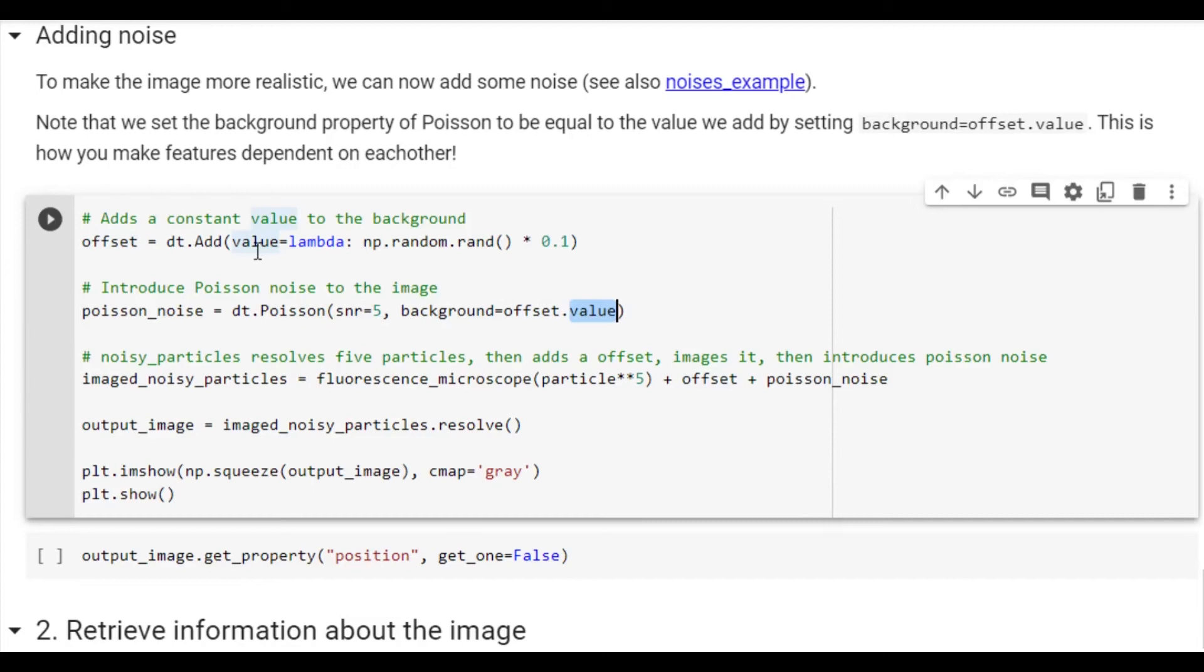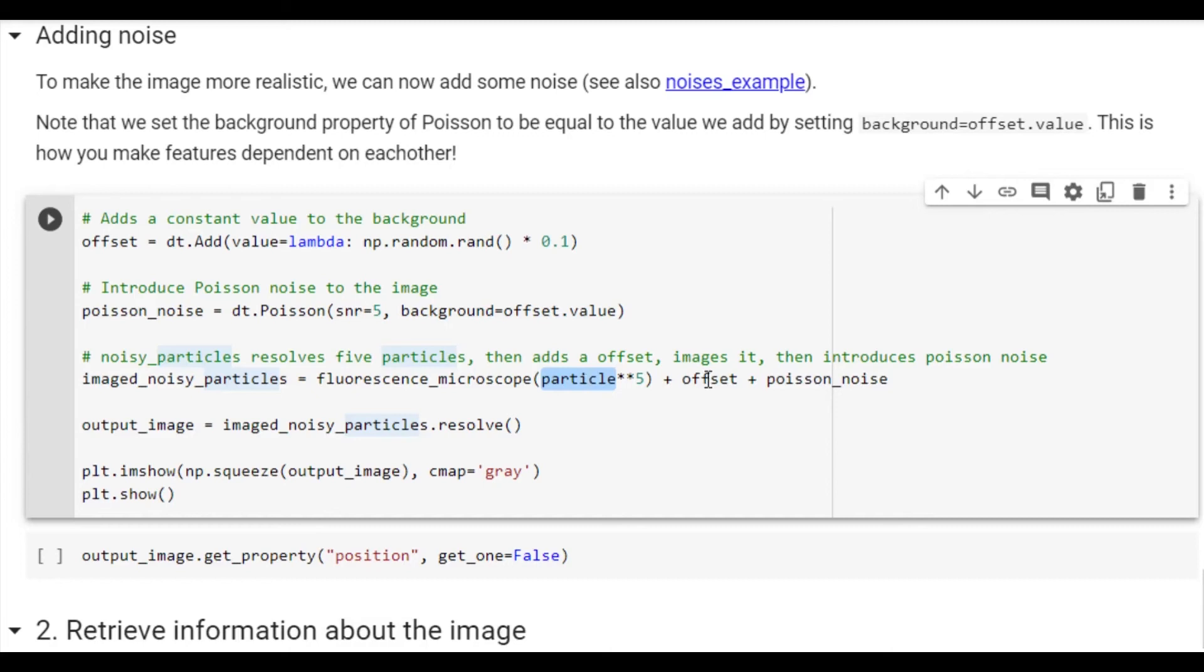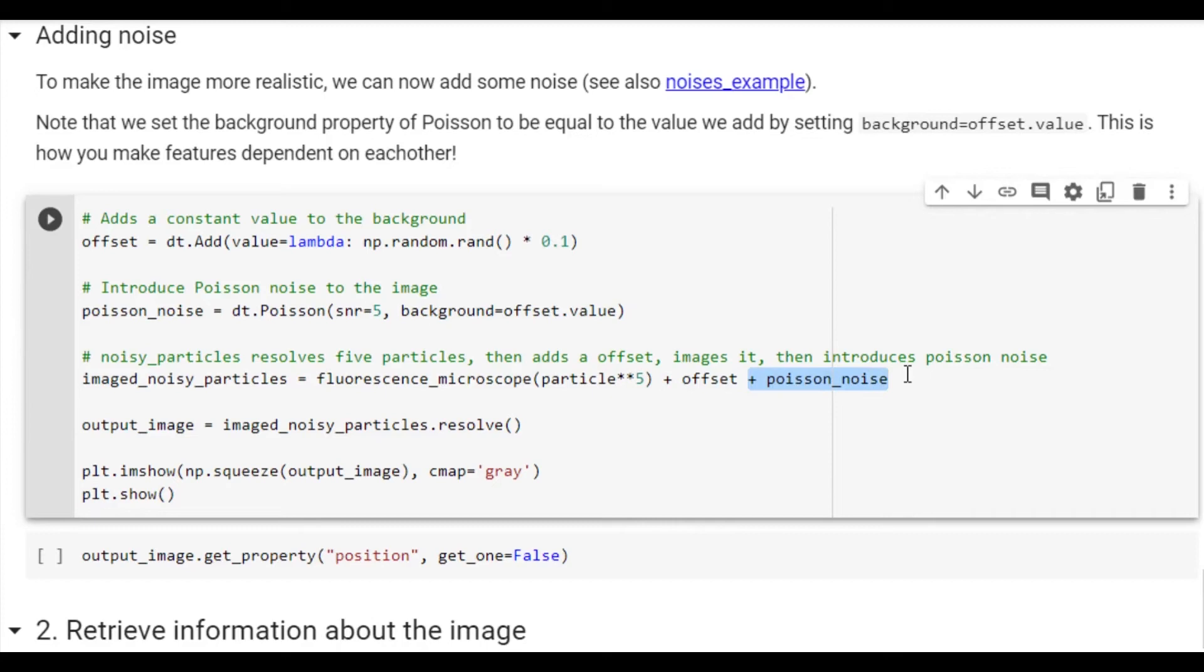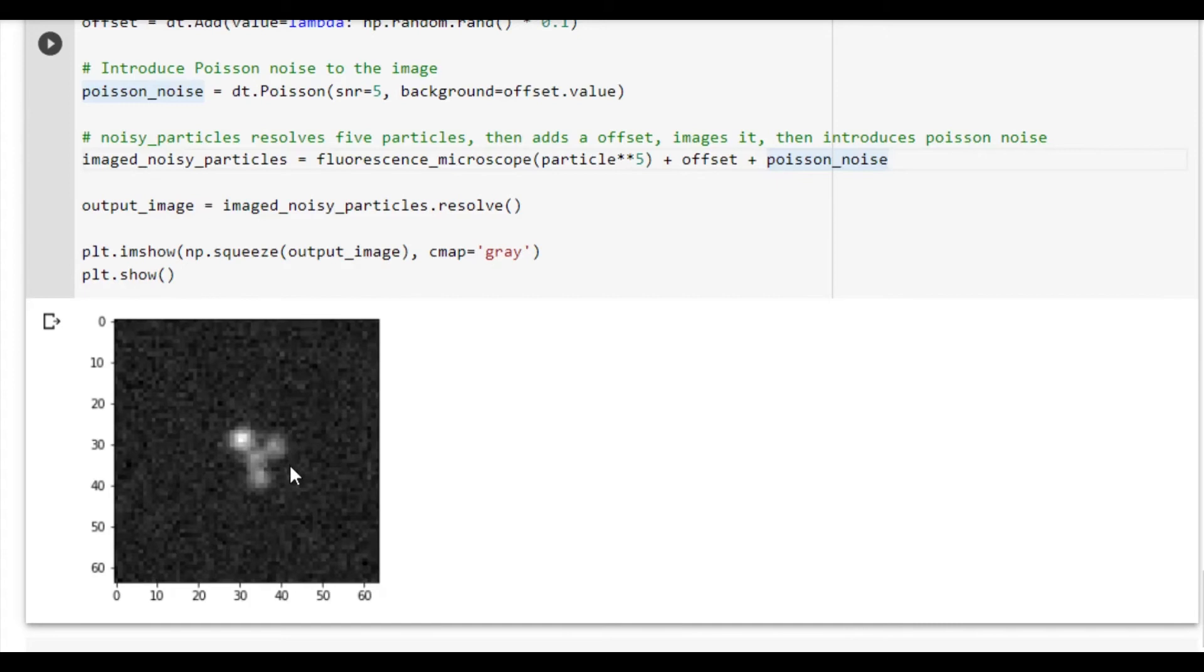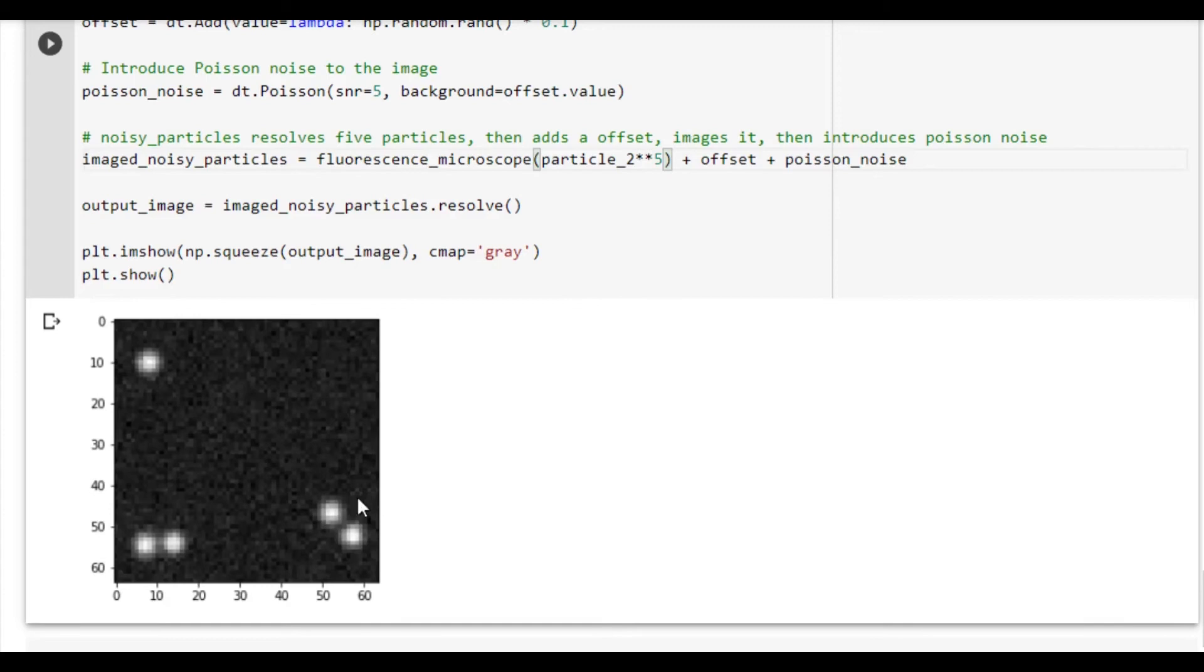In DeepTrack we handle cases like these by determining a dependency between two features. In this case we simply need to say that background is equal to offset dot value. This can either be defined between two features or between two arguments within a feature. For example, you could then define the signal-to-noise ratio to be a function of the background intensity. We use the fluorescence microscope to image five copies of a particle to which we add offset and Poisson noise. We use the plus operator, which means that first the image of the particles is resolved. Then, this is sent as an input to the offset feature, and the output of this is sent as an input to the Poisson noise feature. If we run this cell, we see that the image is indeed noisy and that the particles are close to the center. This is because we use the particle feature, which is normally distributed around the center of the image. We can change this to use particle two, which is uniformly distributed within the image.